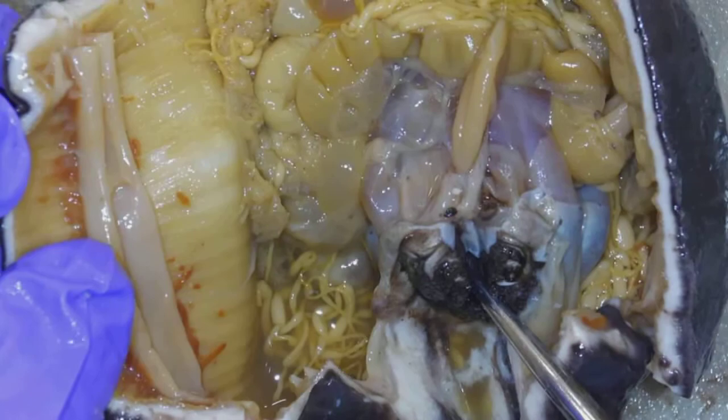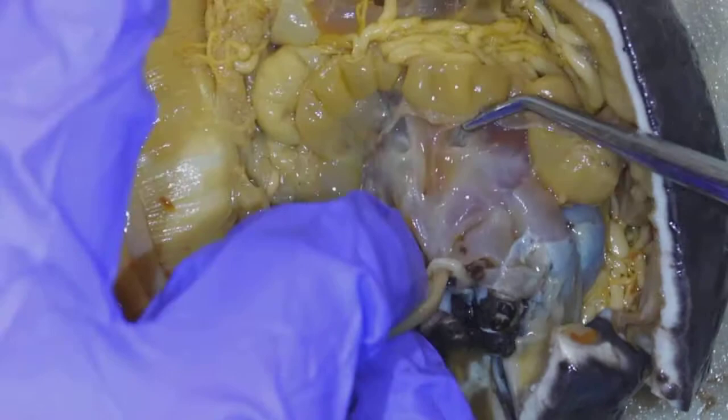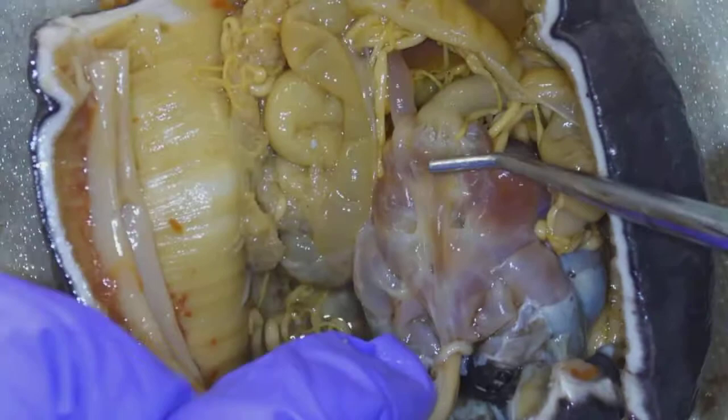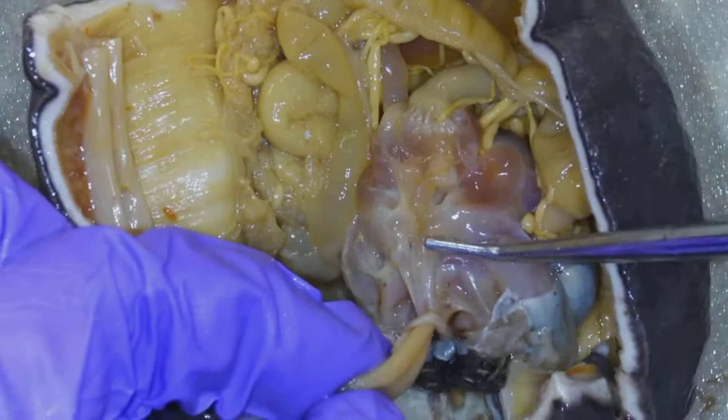The opening here through the tentacles is going to be the mouth. So this opening in the tentacles is the mouth. You can see this is a cut longitudinal muscle. Right after the mouth is going to be the stomach.